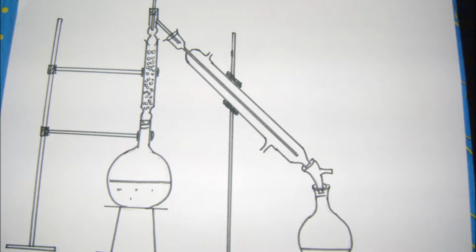Now this is the diagrammatic representation of fractional distillation. This is the round bottom flask containing the two liquids to which heat has to be provided. This is the fractionating column. This is the condenser, which is required to maintain a low temperature. This will be the water outlet through which water will flow out to the sink, and this will be the water inlet through which the water will flow inside the condenser.